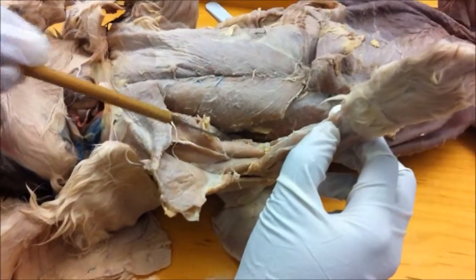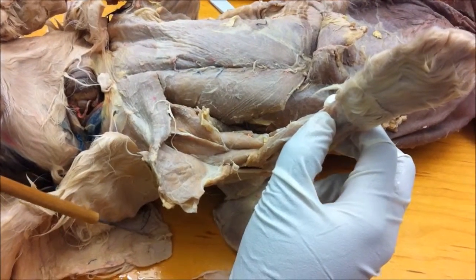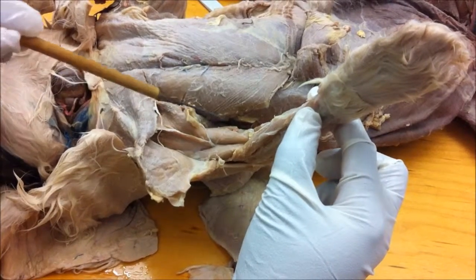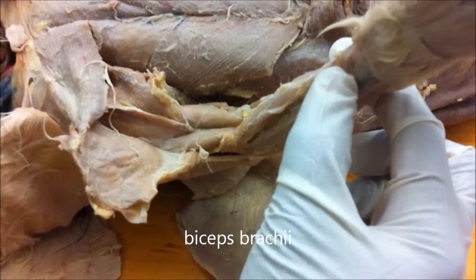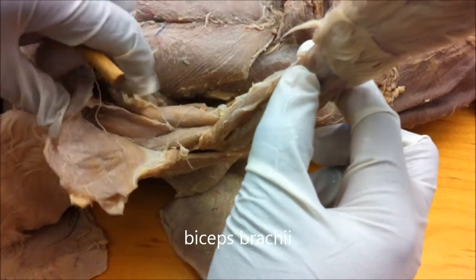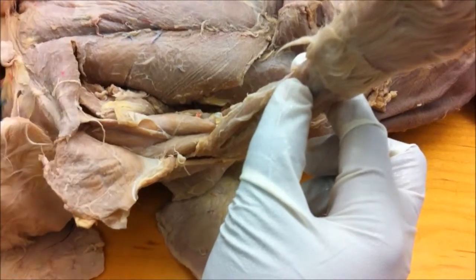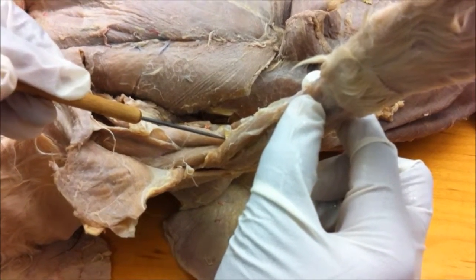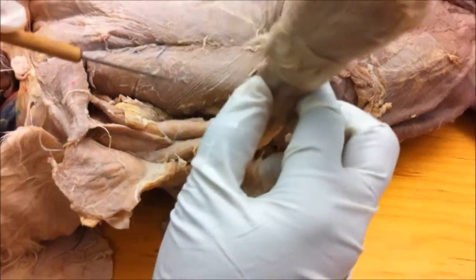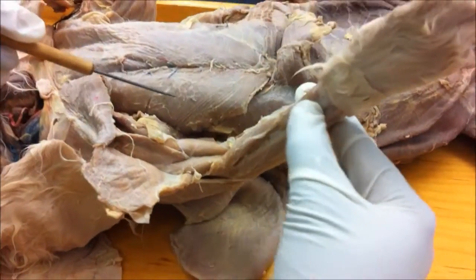Alright, the muscles that move the forearm. Biceps brachii. Its origin is the short and long head of the scapula. The insertion is the radius, the radial tuberosity. And the action is it flexes the forearm at the elbow and supinates the forearm.